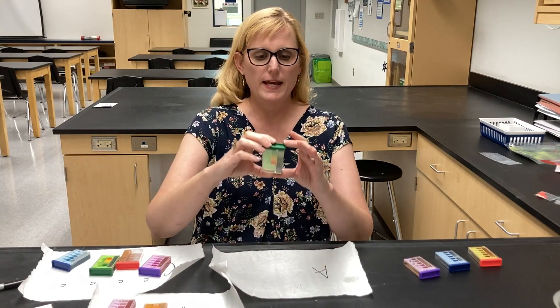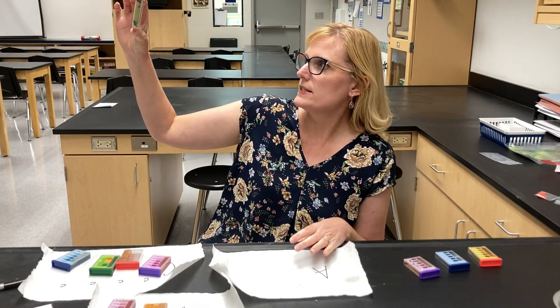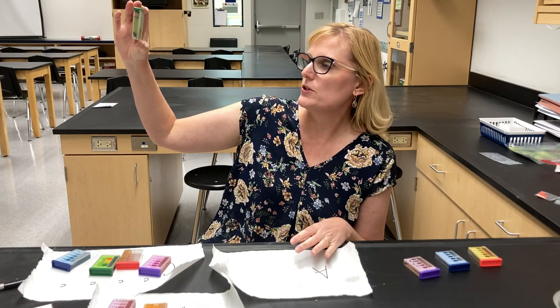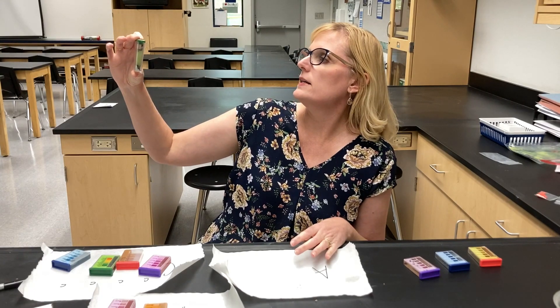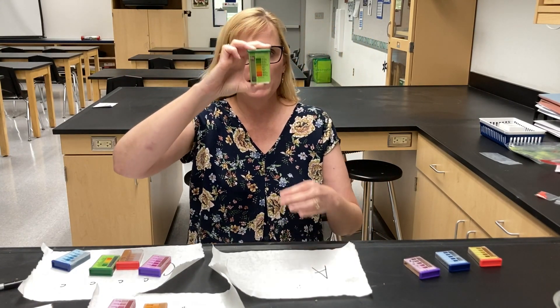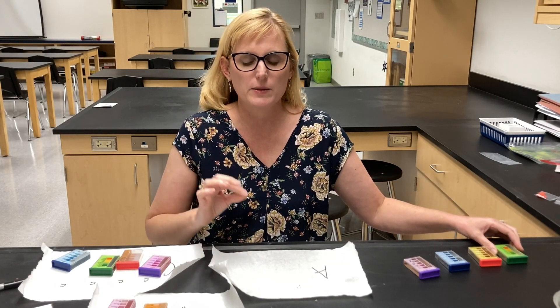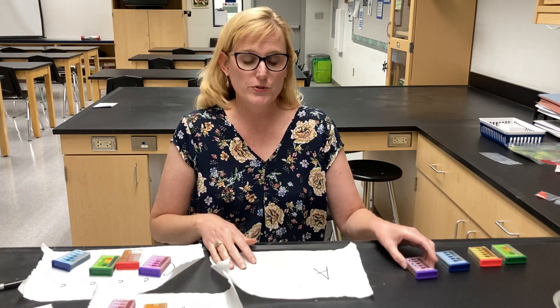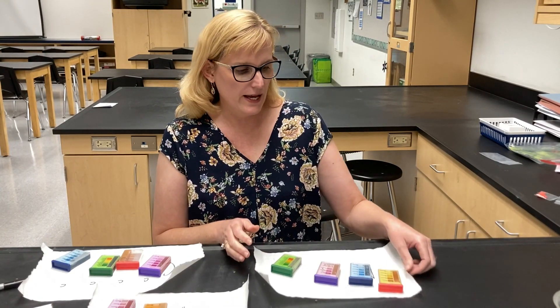And then the pH is very light here. I would estimate that it is somewhere between 6 and 6.5, maybe more like 6.5, which is a nice pH for plants — plants like it neutral or slightly below. So those are the results for sample A from your soil.